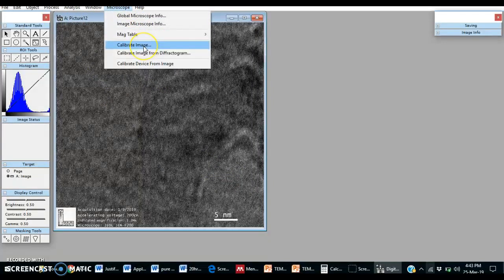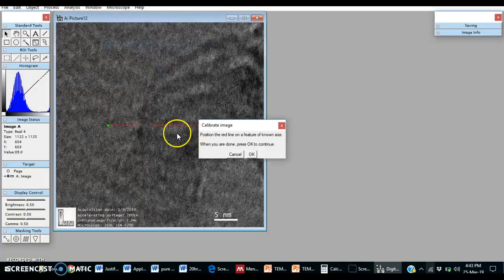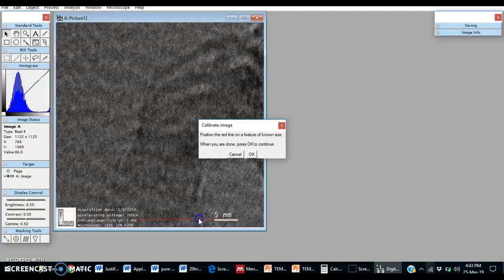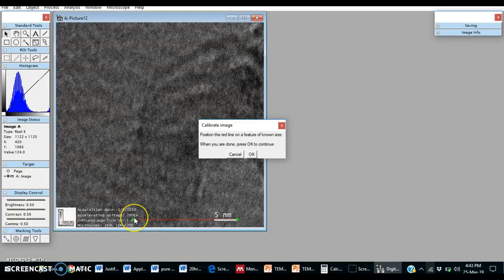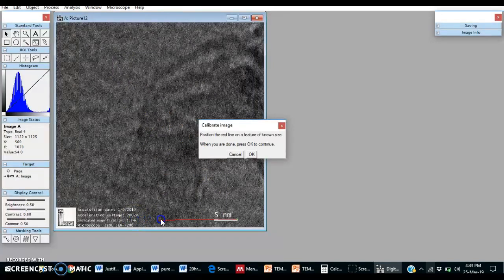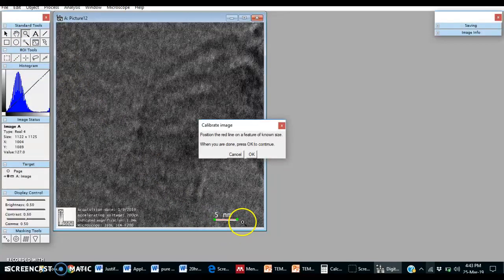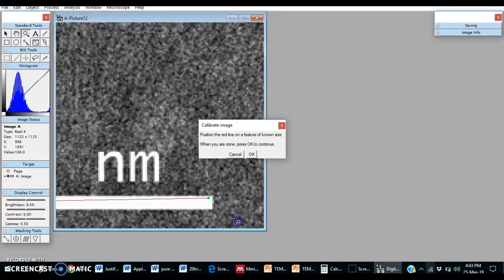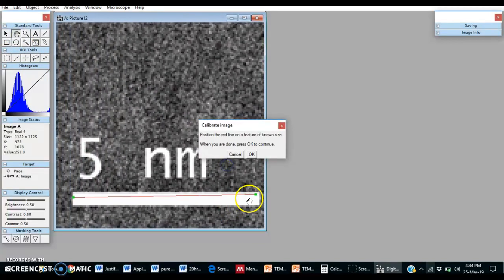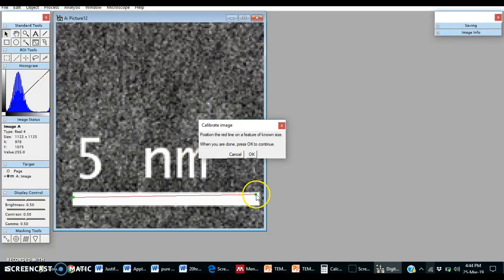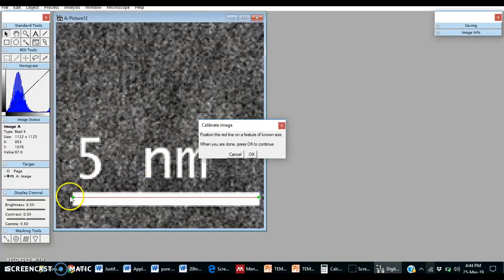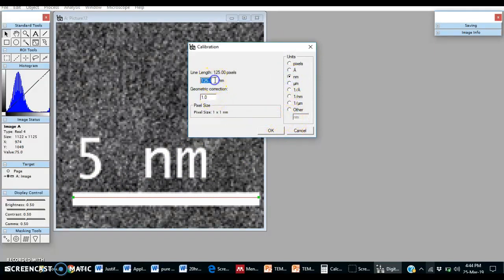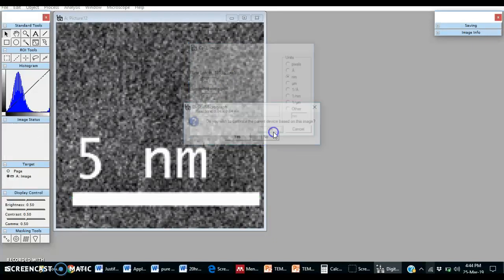Put this arrow on this scale. Make it small. But if you want to do it precisely, then we need to zoom it. So this is five nanometers. This is a calibrated image now.